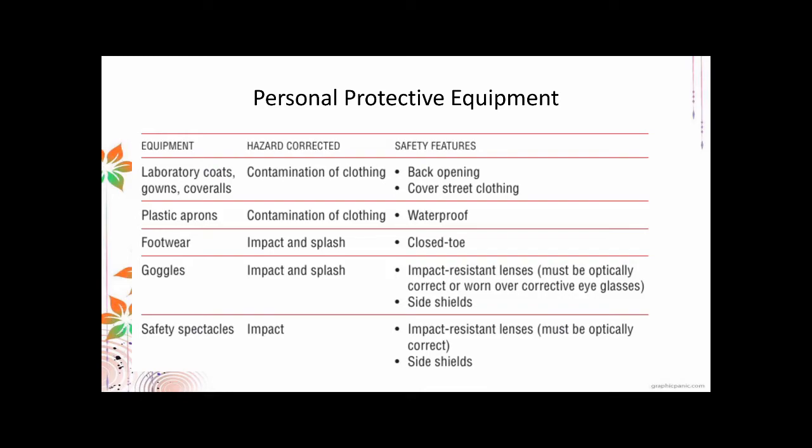So you need to know which is clean, which is not clean. So the front is dirty, the back is clean. So having an opening at the back is actually a measure to keep the inside clothing cleaner.